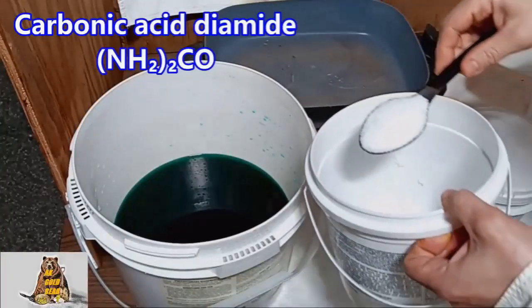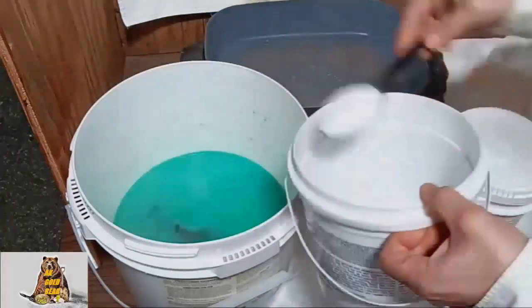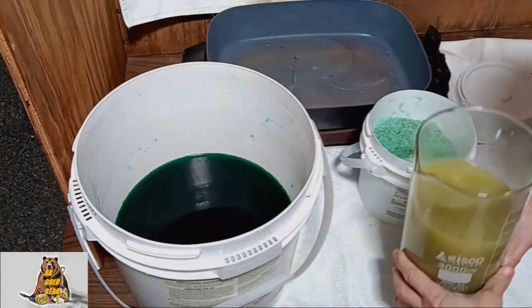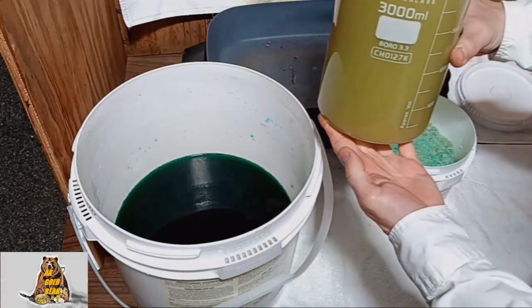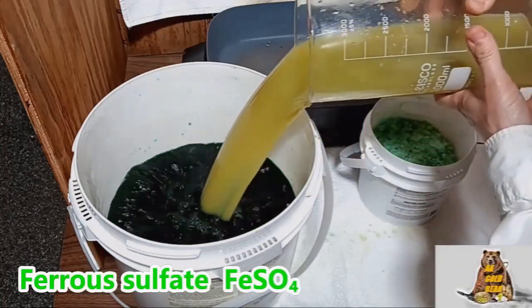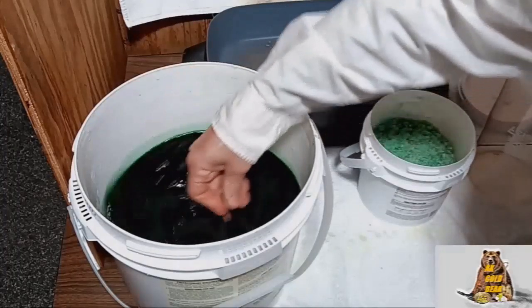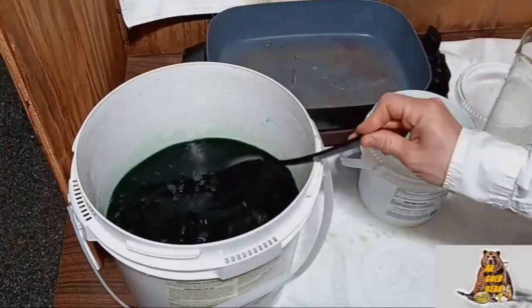Adding urea to neutralize the nitric acid. I will precipitate gold with iron sulfate. My iron sulfate is one year old — very old — that is why the solution looks rusty. I want to leave the solution overnight because it's too late right now, one o'clock in the morning. See you tomorrow.